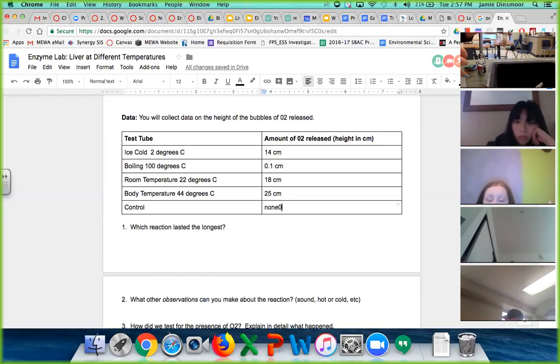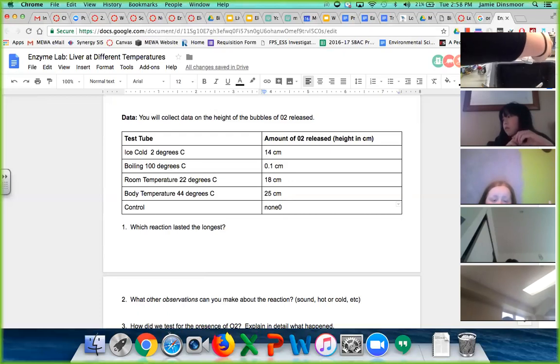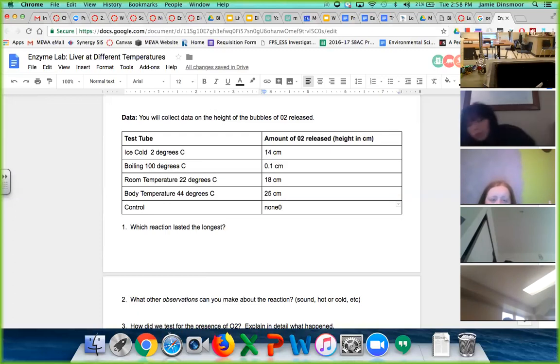All right, 2 milliliters. There we go. Now we can actually see bubbling. Bubbling is occurring. I'm going to measure the height of the bubbles. They are increasing, right? They're coming up to the top of the tube at this point. If you can see the liver itself, you see that it's going crazy with the bubbling right next to the liver. Bubbles are increasing up out of the test tube. Still getting a little higher even. And we're going to call that at 13 centimeters.